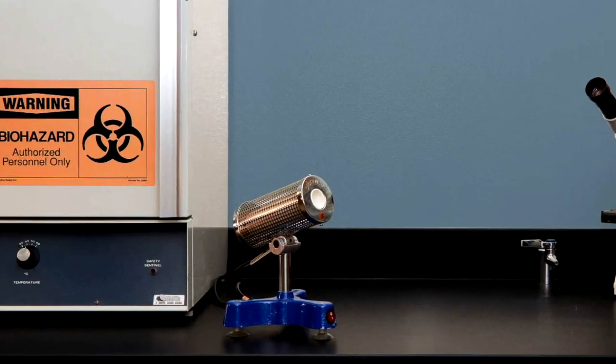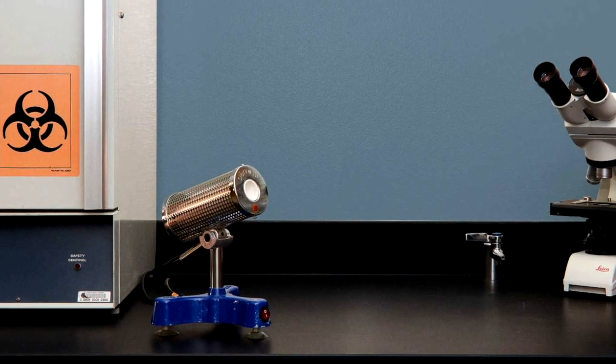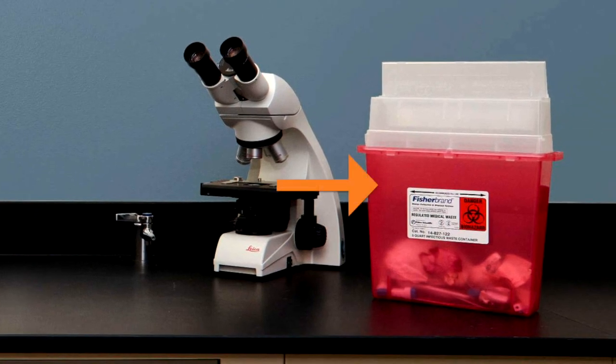There is an incinerator that you will use for sterilizing your inoculating loop and wire, and for flaming the mouths of tubes during transfers. A microscope is provided for observing stains of organisms. At the right is a biohazardous waste container in which you will dispose of your used media and cultures.